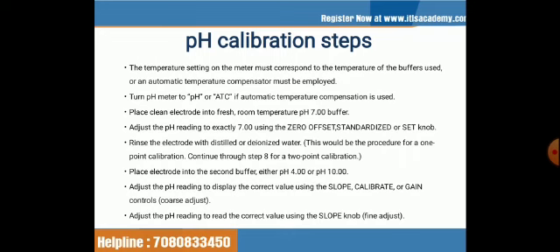This would be the procedure for 1 point calibration. Continue through step 8 for the 2 point calibration. Now what happens?